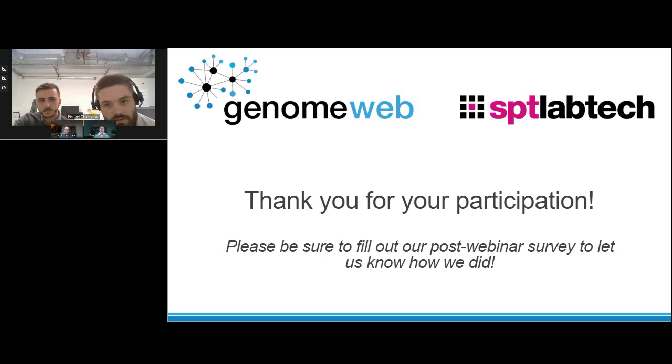As you can see in the results that we had, we have more than enough data and depth for all of our samples using the NovaSeq. So maybe this is something that we would encounter if we put a lot more samples in our runs. But for now, this is not an issue that we have encountered.